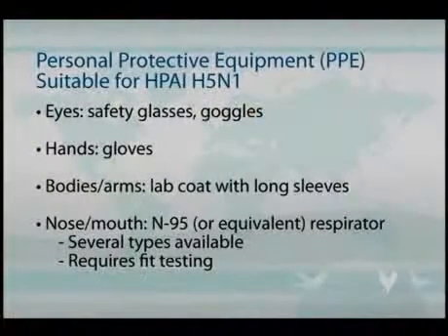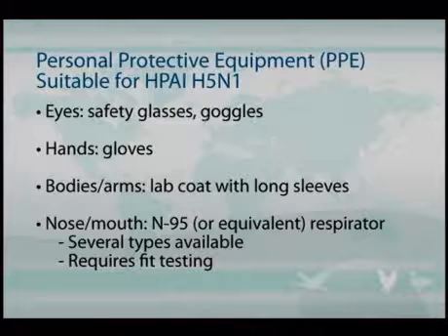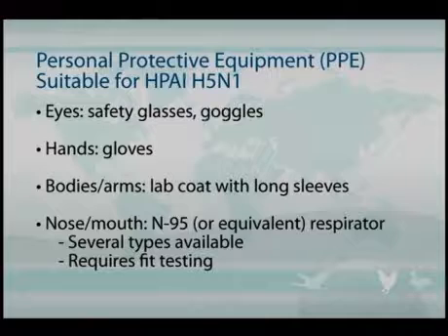Now, many of you probably have questions about what is acceptable in terms of working with the highly pathogenic H5N1. And these are some of the general guidelines that we have established. We would not say that these are the absolute optimum procedures to protect yourself, but again, refer to the BMBL.